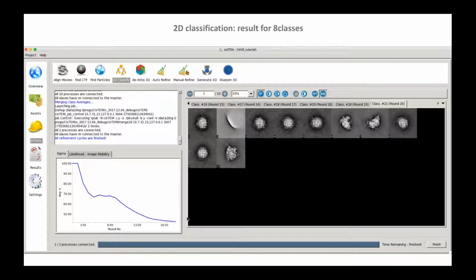With some of these later programs, they tend to pool particles into class averages that have higher resolution, so maybe you could do 1,000 particles per class. Just keep in mind that you're binning the data.